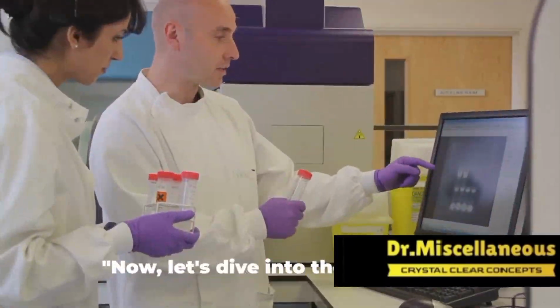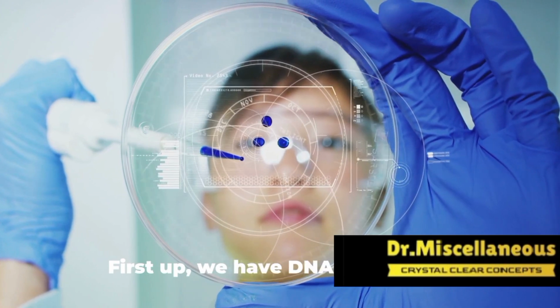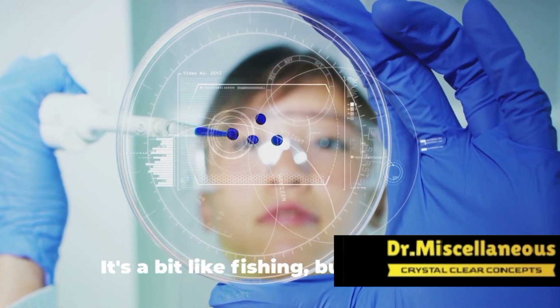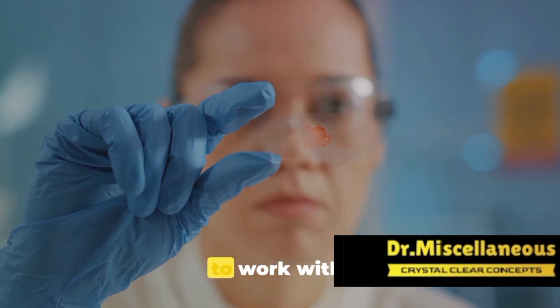Now let's dive into the process of Sanger DNA sequencing. Imagine the process as a journey with 4 main stops. First up, we have DNA extraction. This is where we obtain our DNA sample. It's a bit like fishing, but instead of fish, we're after the genetic material. We isolate the DNA from the rest of the cell components, giving us a clean sample to work with.